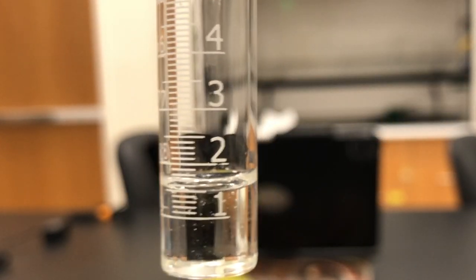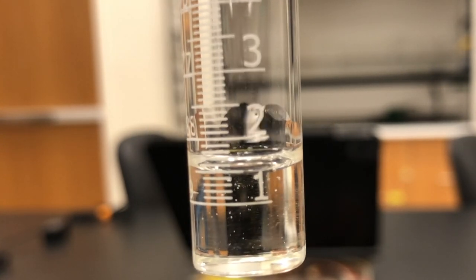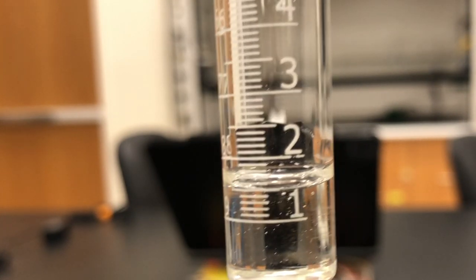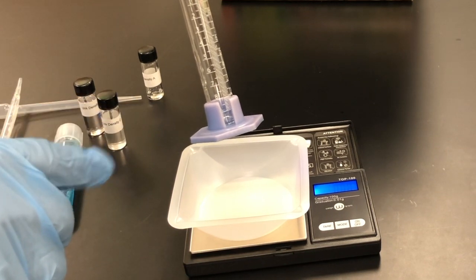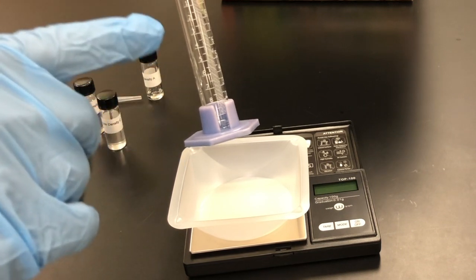So we're going to be reading that. Again, you need to be perfectly horizontal and you need to read that volume. And this particular volume is going to be read at about 1.50.